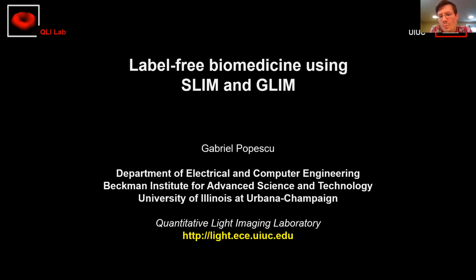Now, first of all, we developed this method to back out the rheology from the fluctuations of the membrane. So normally, for macroscopic objects, you apply the strain yourself with the cone and plate or whatever methods. At the micro scale, you can rely on the Brownian motion doing the activation for you. Because the membranes are so soft, at room temperature they fluctuate, but the standard deviation of this fluctuation is about 30 nanometers, 50 nanometers, very small. So this phase imaging method was perfect for this application.